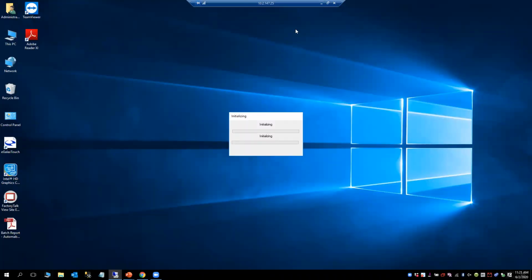So currently we have a computer that has been disconnected. We will connect back up. This is a little bit of technical difficulty with the remote sharing of applications. So we will continue our demonstration just as soon as our file loads back up. Meanwhile, I would like to again stress the differences between the development, production and archiving versions.